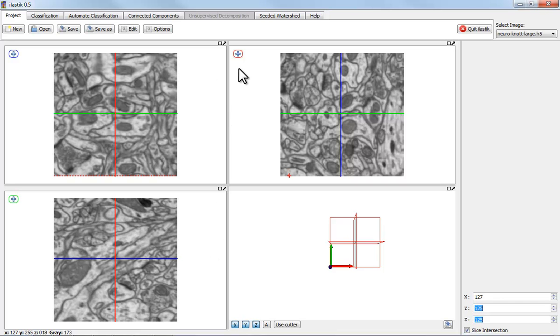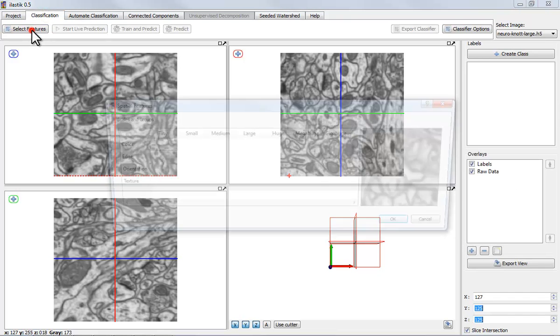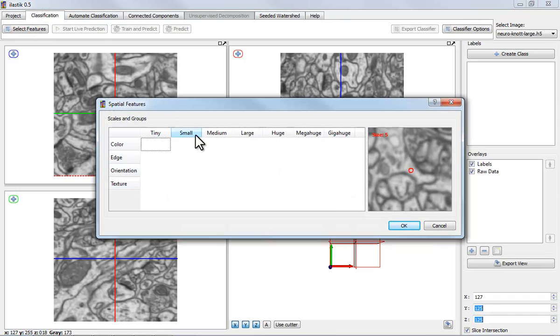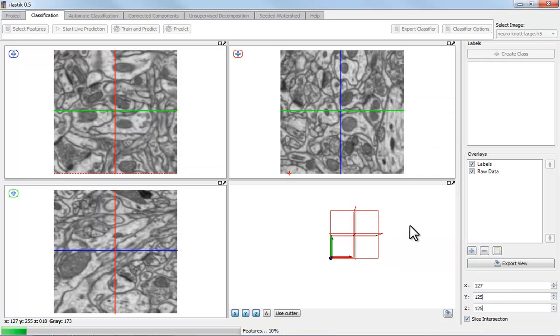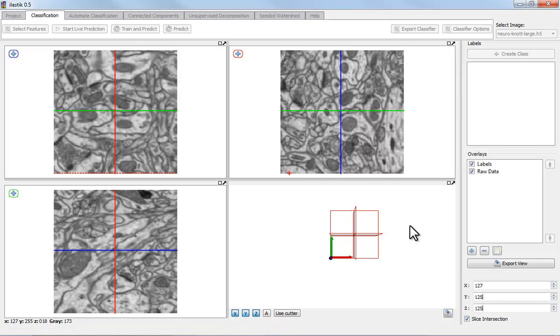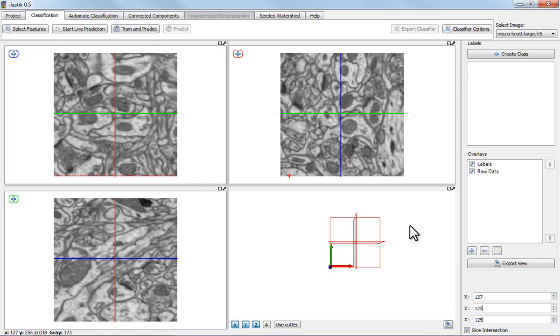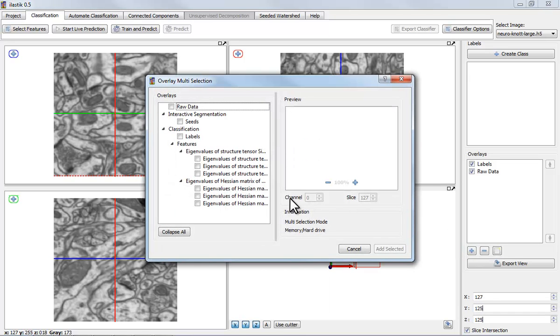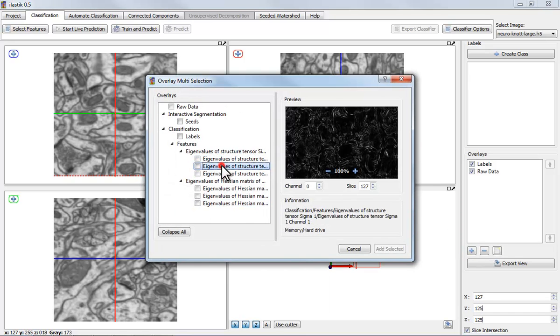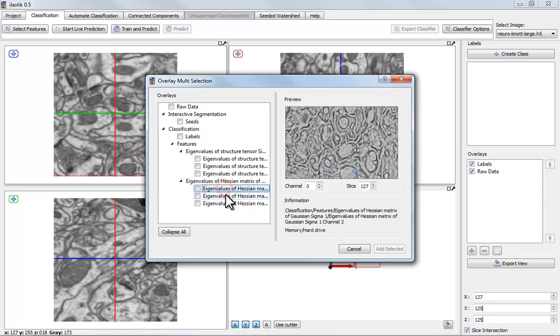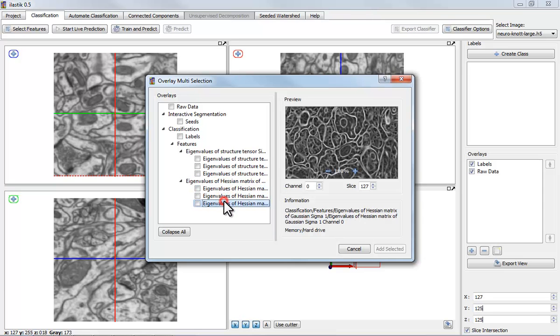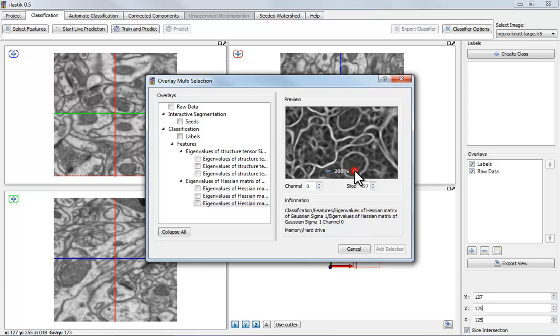Now the Seeded Watershed relies on the seeds provided by the user and good boundaries in the data. So I'm computing some features here which I have previously experimented with and that I've seen to give me a good indication of boundary strength. As always, we can look at these features and you see that there is one, this one here, which brings out the boundaries nicely.